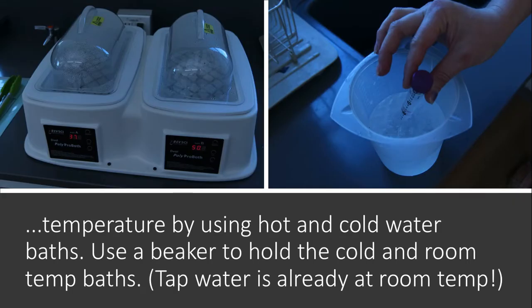The last one that we'll be using is temperature. We know that temperature is a really big element in maintaining homeostasis for our own bodies. So that may give you a clue that enzymes may need to have specific temperatures in order to do their functions. If we expose them to hot or cold temperatures, how might that affect the rate at which the enzyme is making the potato brown?